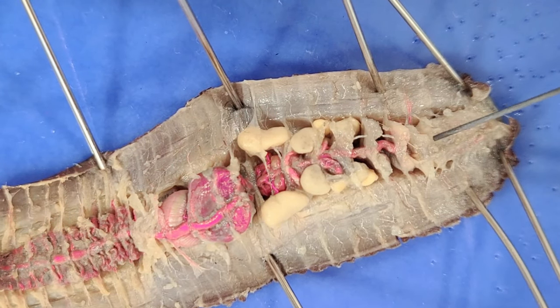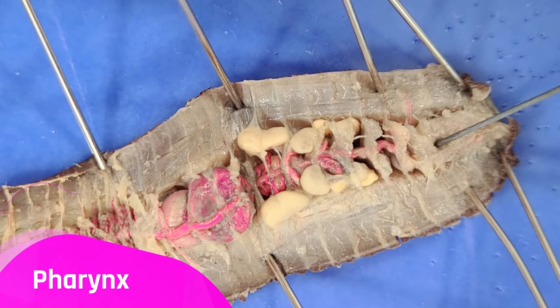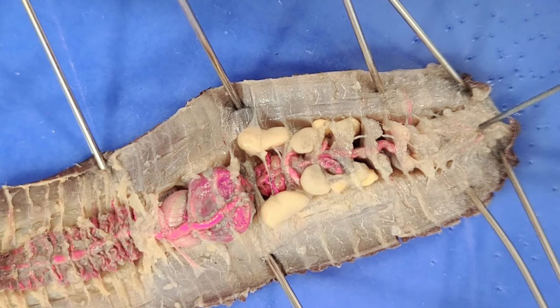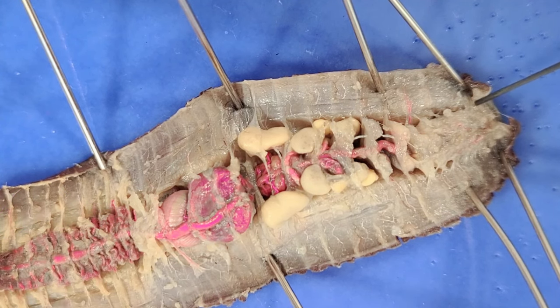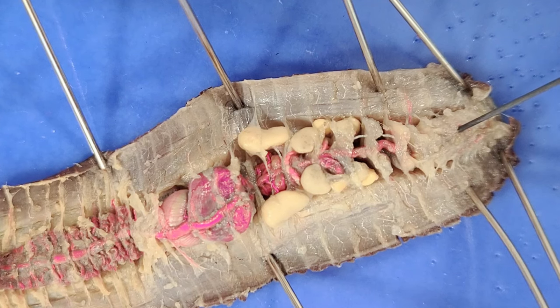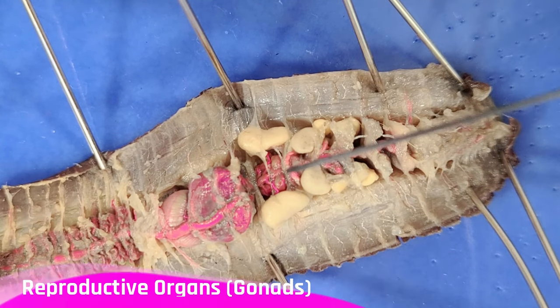At the beginning of the digestive system is the pharynx, which is right here. The pharynx acts as a suction pump to draw food in through the mouth, which is right here. The pharynx also secretes mucus that lubricates the food so it can travel down the rest of the digestive system.